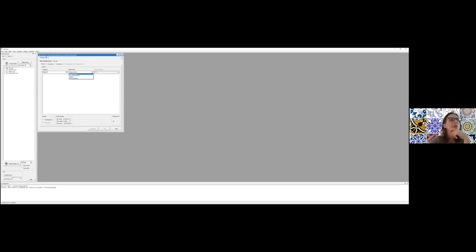So, okay, we chose the category. We said it's an ellipsoid. And the model name is going to be ellipsoid again. And you see that it populates a number of parameters. And you can change the thickness of the column so you can read it all.